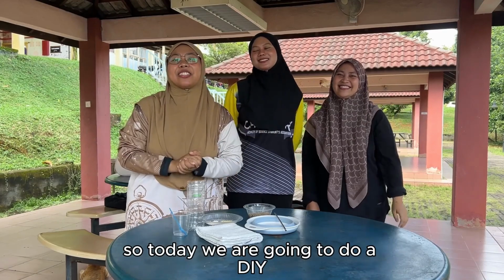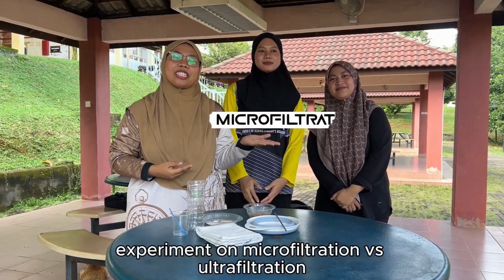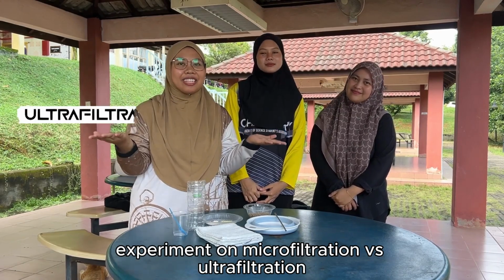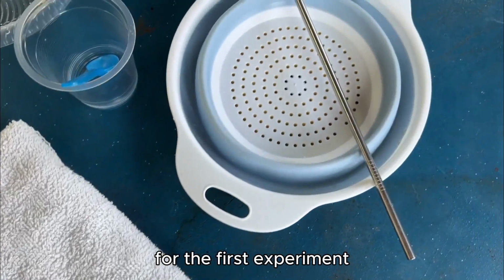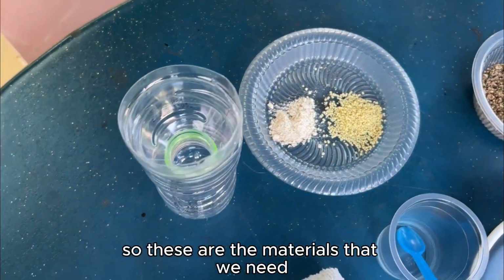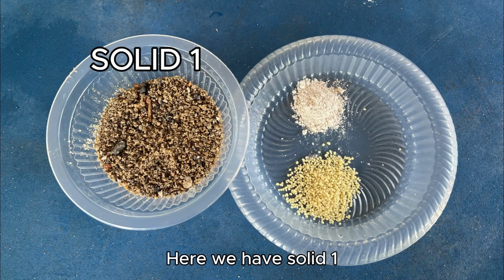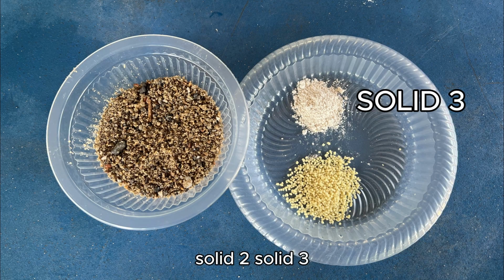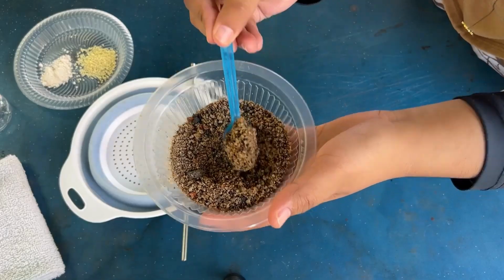Hi! So today we are going to do a DIY experiment on microfiltration versus ultrafiltration. Let's go! For the first experiment, we are going to demonstrate the microfiltration technique. So, these are the materials that we need. Here, we have solid 1, solid 2, solid 3, membrane, receiving bottle, funnel, stirring rod, and lastly, water.